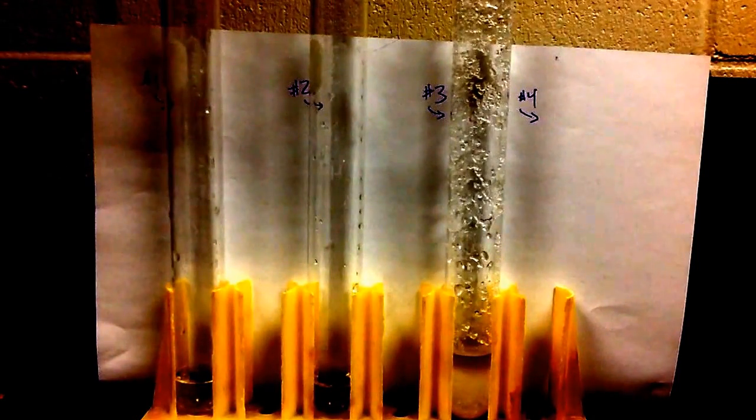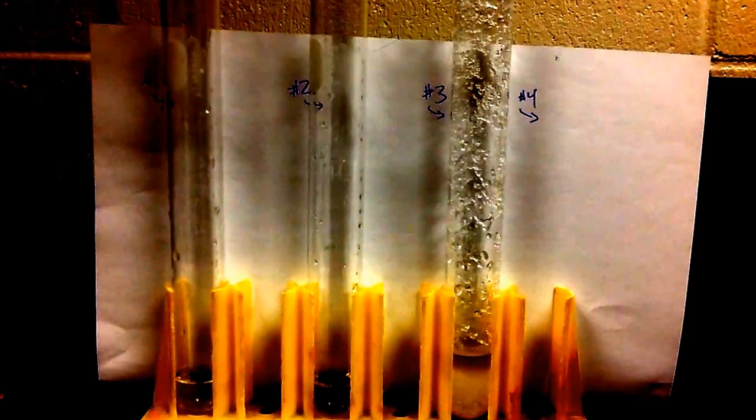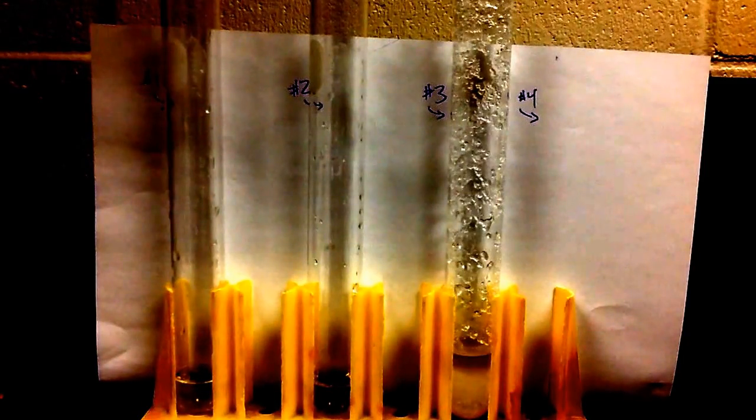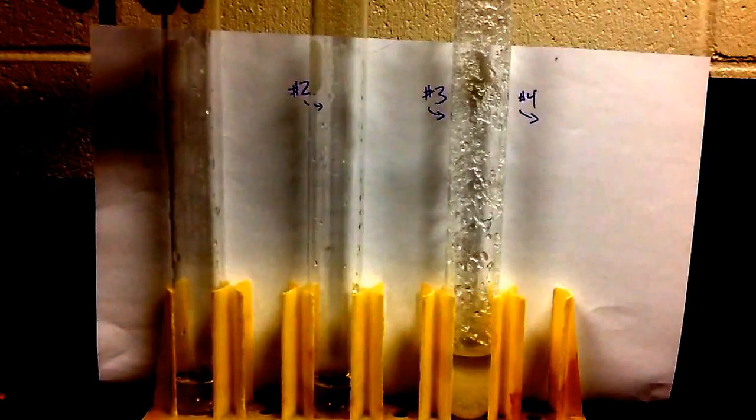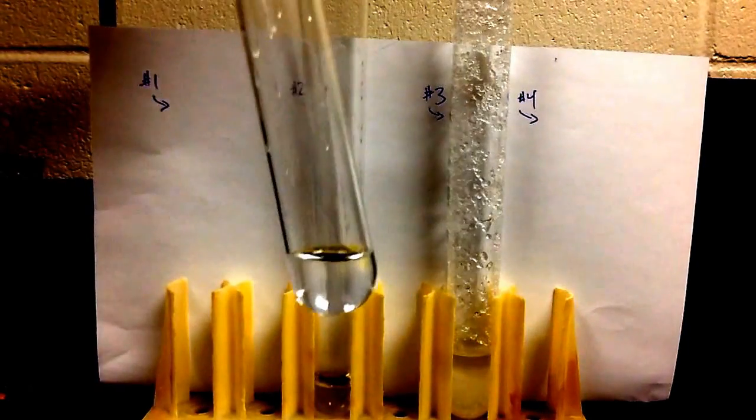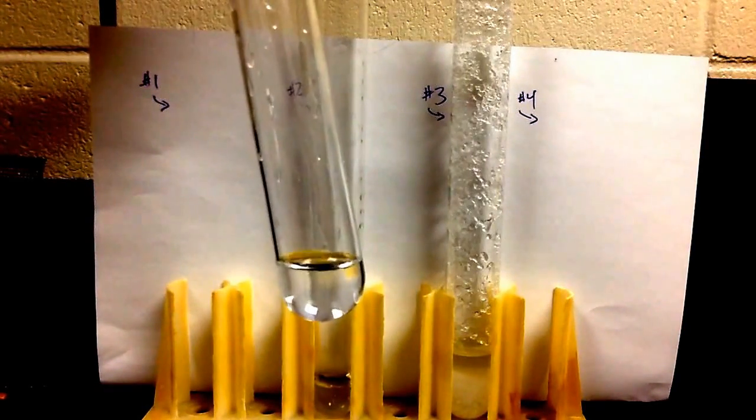So what we're going to do is talk about the three different things we've done in our lab, and then explore our fourth one. First thing we did is in our first test tube, we added five milliliters of water, and that was all the water we were going to add for our lab.